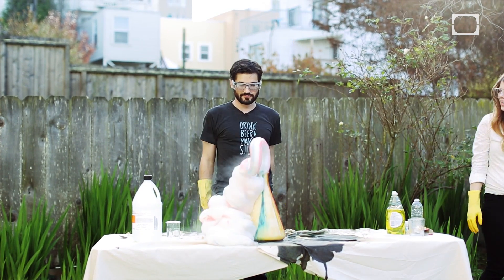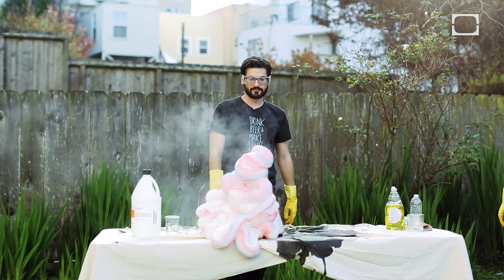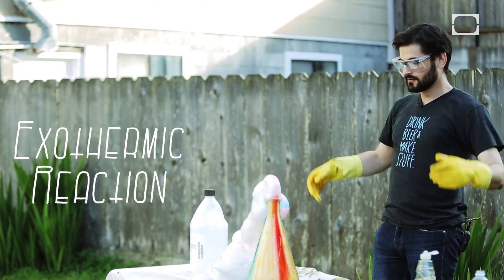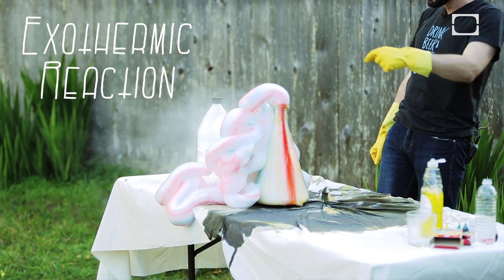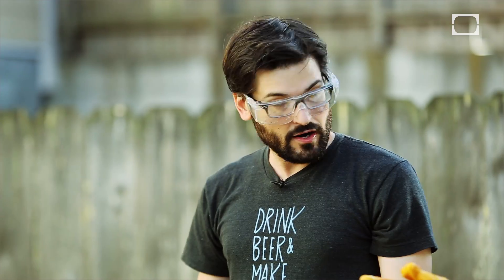Oh, it does look like toothpaste! It actually works. I thought it would all just sort of mix together. I like that initial bit, but then it slowed down and I got sad. So I feel like I'm going to need more. Always wanting more.